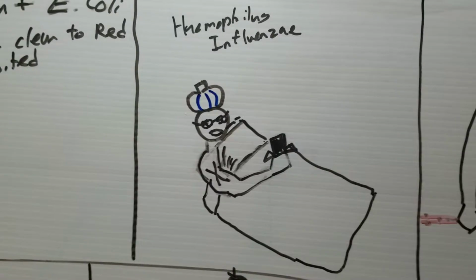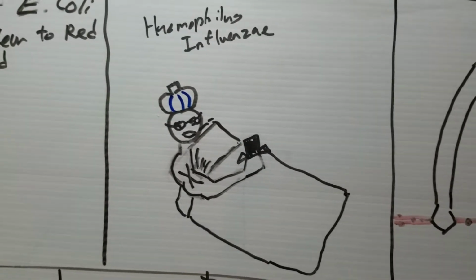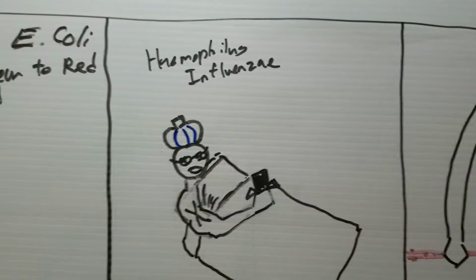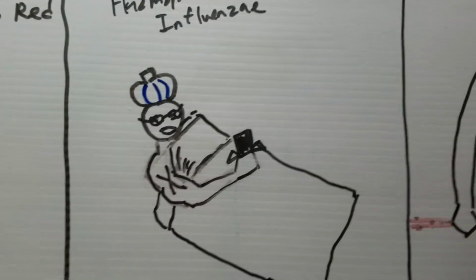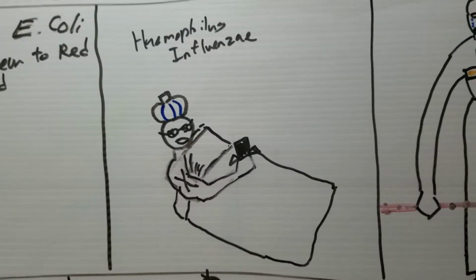specimen, Haemophilus influenzae. It's shed by this particular organism. And which type of agar plate is this? Well, what is this in his hand? You might think it's a phone, but actually you see these little things poking out. That's actually supposed to be a wrapper, so he's actually holding some chocolate. He's feeling bad, he got some chocolate, and it's chocolate agar.